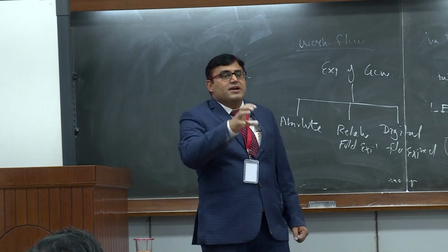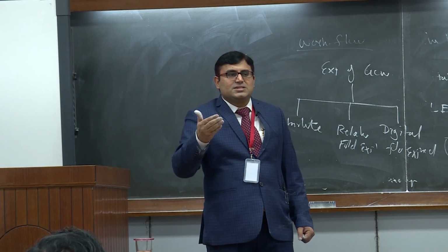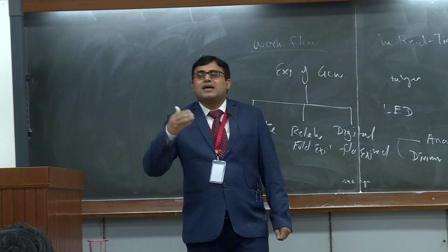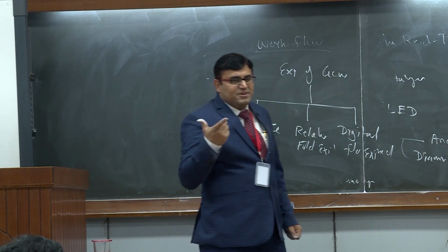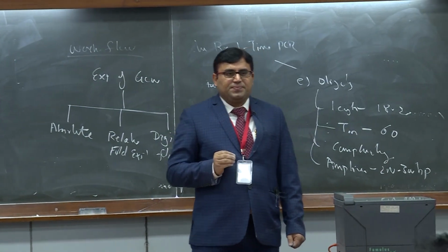It means these 100 transcripts out of the total transcripts, if I calculate this, this is digital fold expression. It means how many transcripts of a specific gene come out of the total. That signifies the digital fold expression of that particular gene.